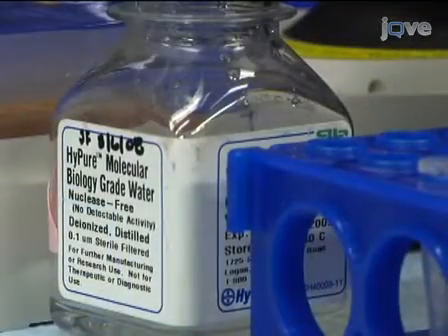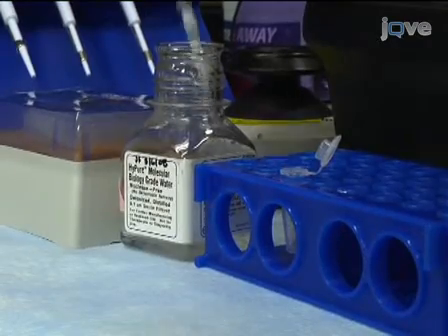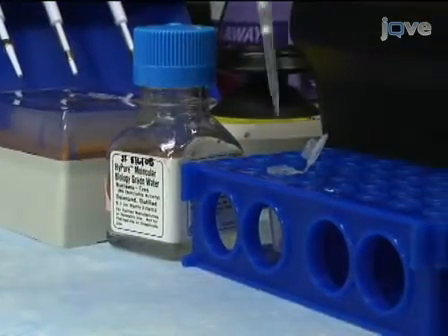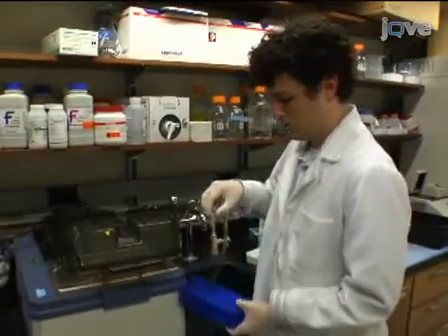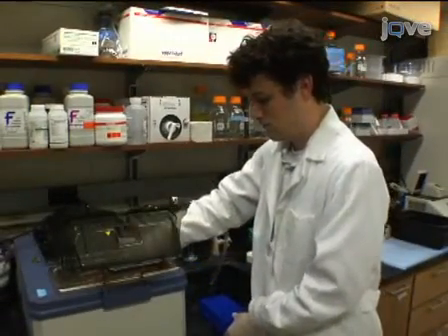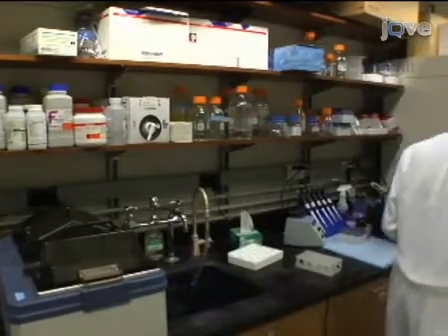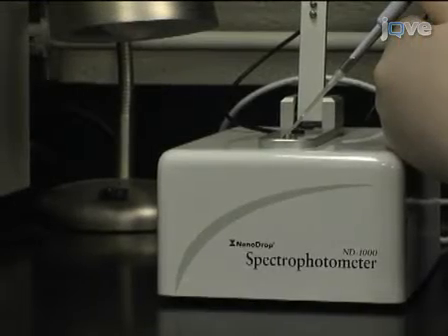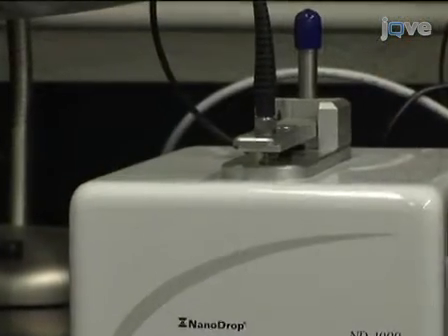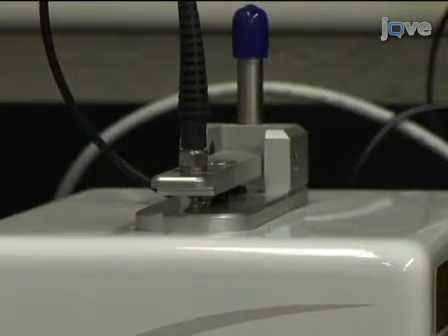Then add 20 microliters of nuclease-free water to rehydrate the pellet. Place the sample at 55 degrees Celsius for 5 minutes for the rehydration. The cDNA can be stored at minus 20 degrees Celsius. Finally, check the quantity and quality of the cDNA product using a NanoDrop ND-1000 spectrophotometer, following the manufacturer's instructions.